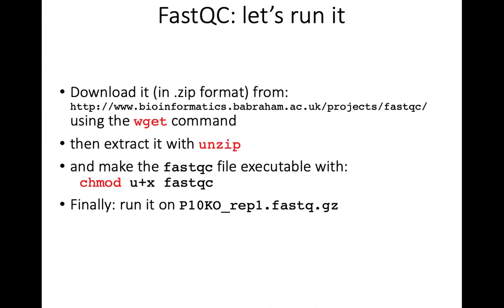I'm not sure what you mean. Here, I cannot see those files. Oh, it's because there was an error there. It's because your DAW scratch, that's going to be your scratch. In my case, it's going to be my scratch. Yeah, so there are different folders. There's like your scratch and my scratch.